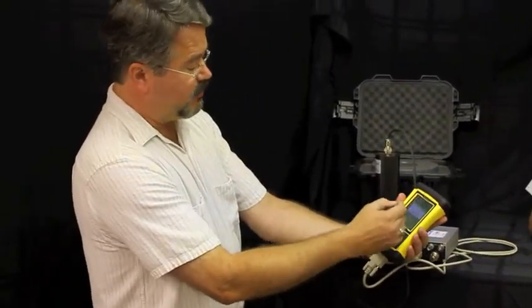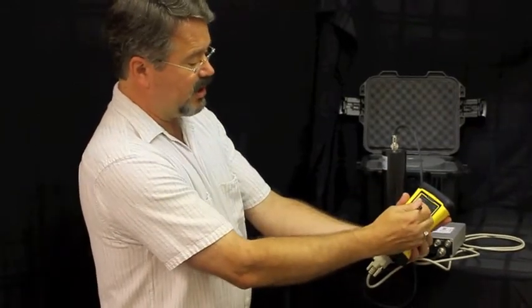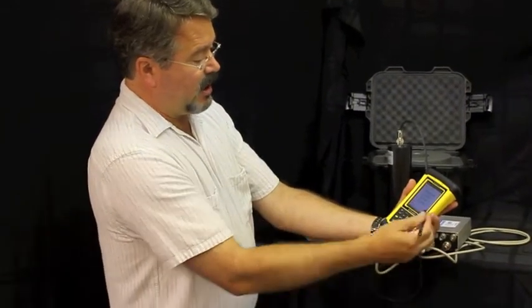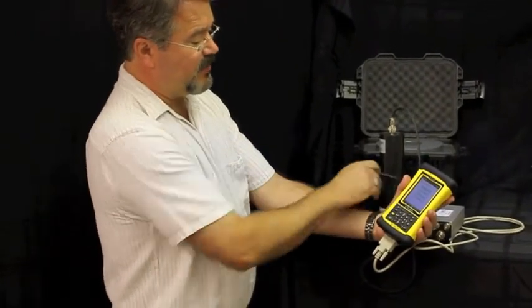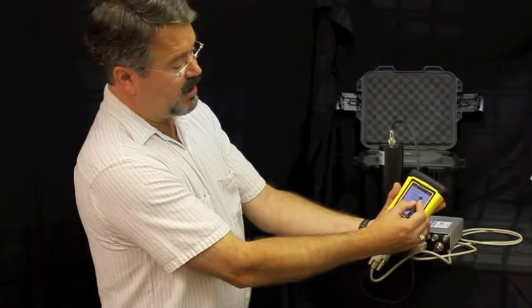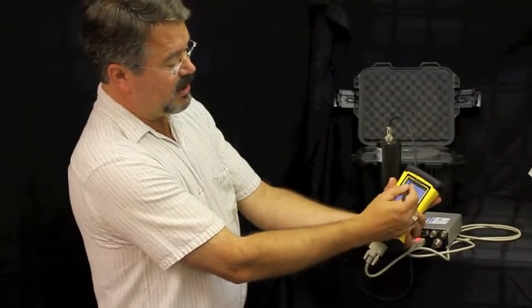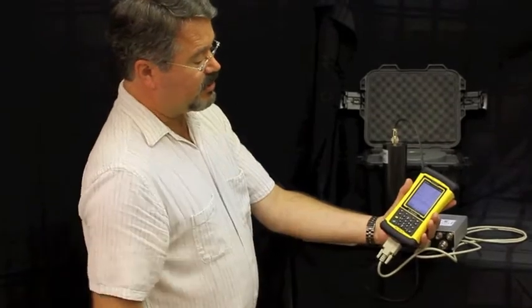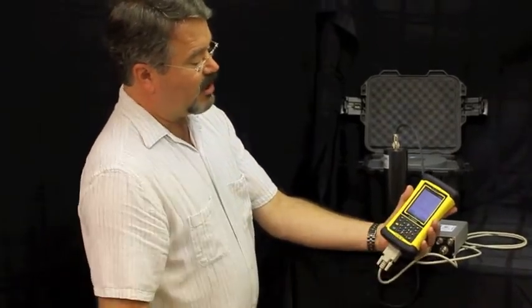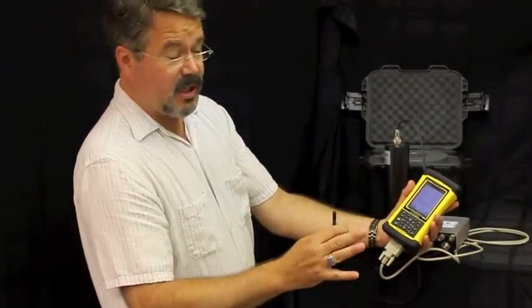It will also say that it's recognized that there is a detector already in the memory of the multi-channel analyzer, named at the top of this, again the 2x2 sodium iodide detector, and we will use that detector. This is followed by, just for the edification, just for the double check, the important properties of the system.